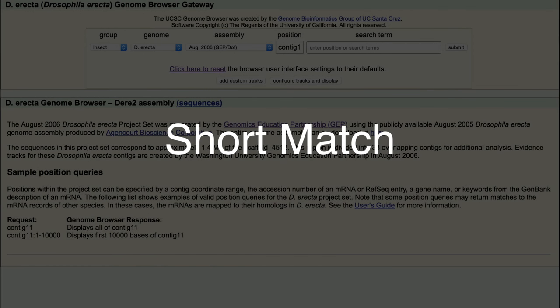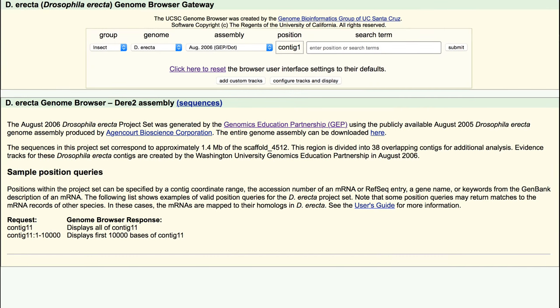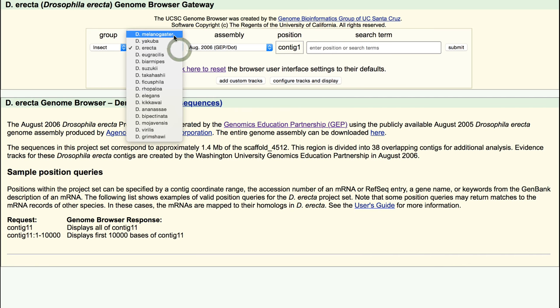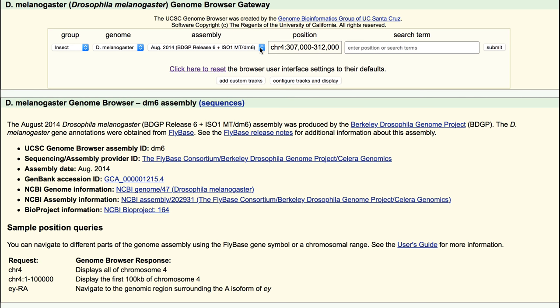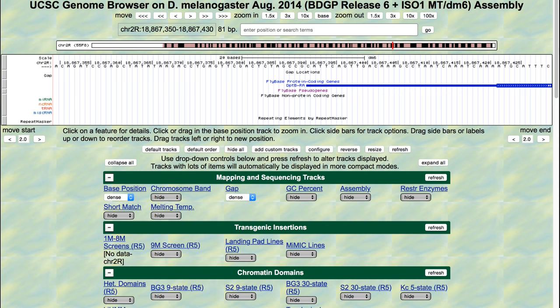Here we will use the Short Match functionality in the UCSC Genome Browser to find a short sequence motif within our contig. Before we get started, go to the Genome Browser Gateway page and select the D. melanogaster genome and the August 2014 BDGP Release 6 plus ISO1MT/DM6 assembly. Enter CHR2R:18,867,350 through 18,867,430 into the search term field and click Submit. This region contains the transcription start site of the Drosophila melanogaster DPTB gene.